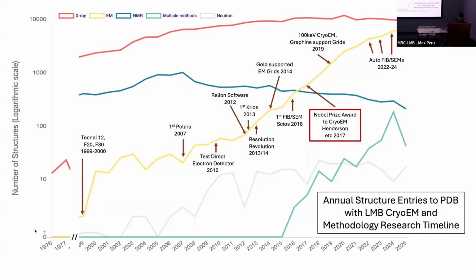This renewal of the facility also indicates the field going to the second stage, with the direct electron detector becoming commercialized, and at the same time all the microscopes improved the vacuum, reduced the contamination, and increased automatic data collection, plus powerful image processing software.